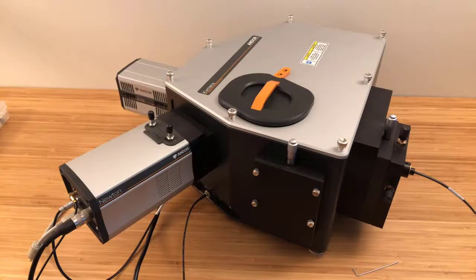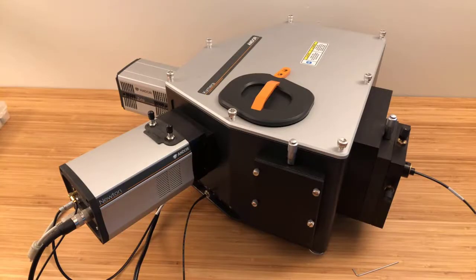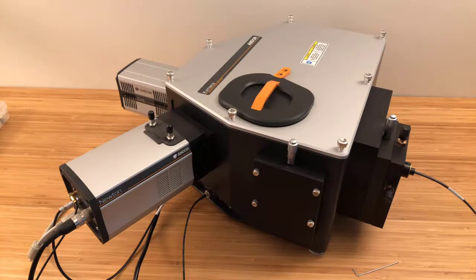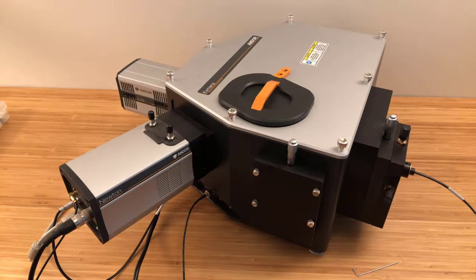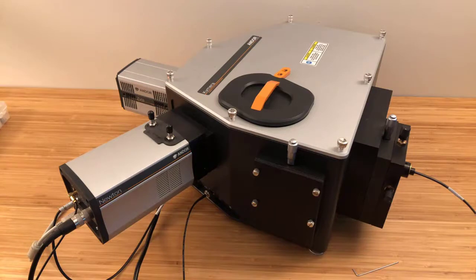Hi, I'm Adam Wise, Application Scientist with Andor in the U.S. You might be familiar with Andor from our wide variety of scientific cameras, spectrometers, microscopes, and other cutting-edge equipment for research and testing.